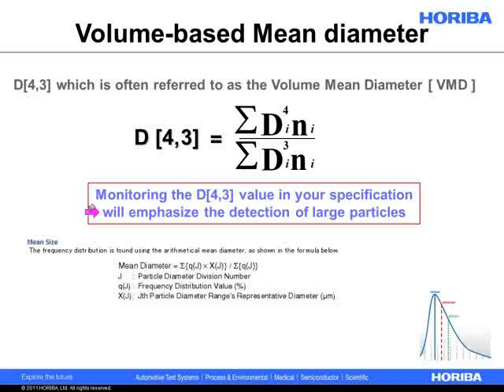Now, even if that's not interesting to your application, one of the takeaways I hope you get from today's presentation is that looking at the D43, the default mean value out of laser diffraction instruments, will always emphasize the detection of large particles. That's the takeaway from this slide.